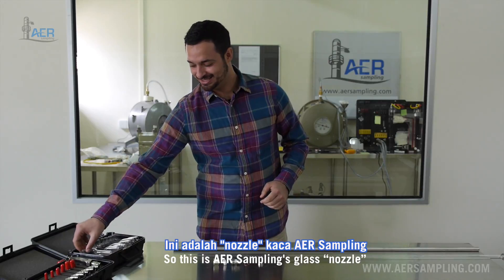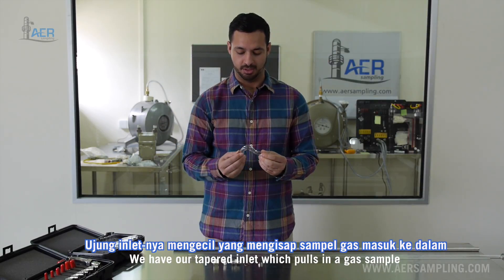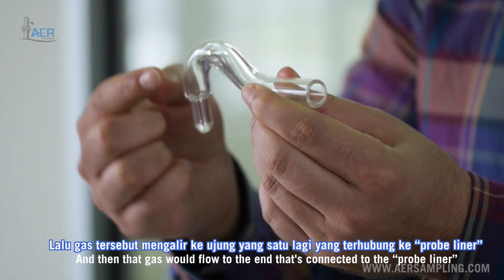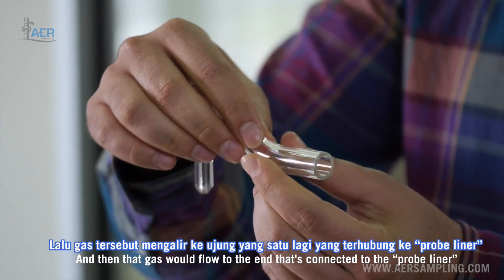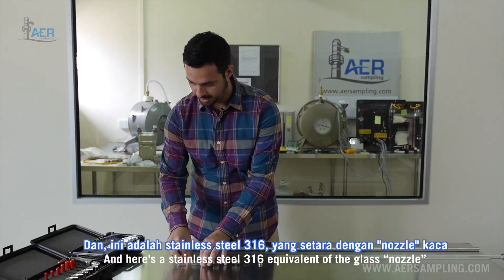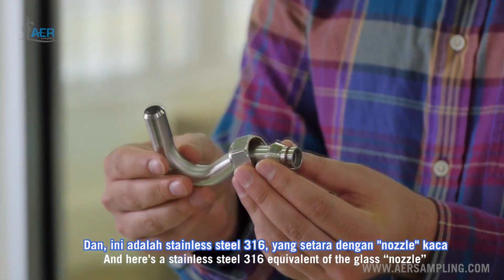This is AER Sampling's glass nozzle. We have our tapered inlet which pulls in a gas sample, and then that gas will flow to the end that's connected to the probe liner. Here is a stainless steel 316 equivalent of the glass nozzle.